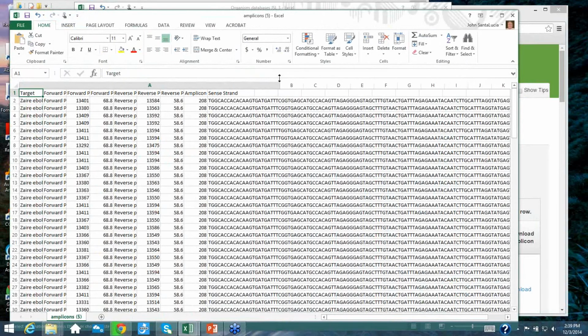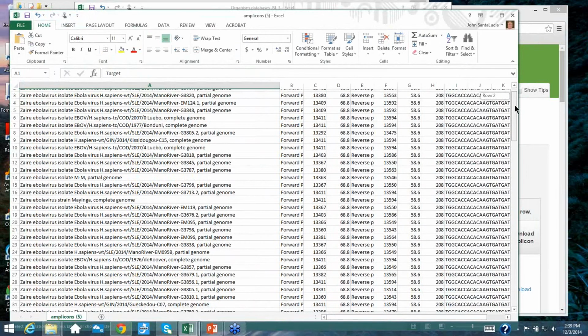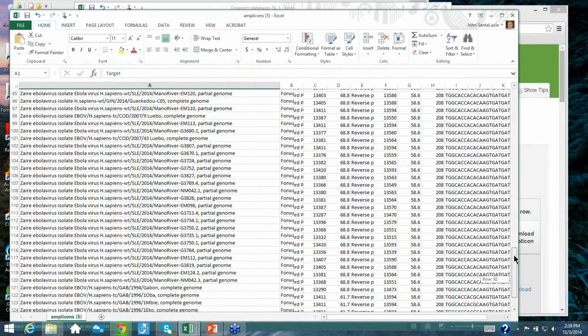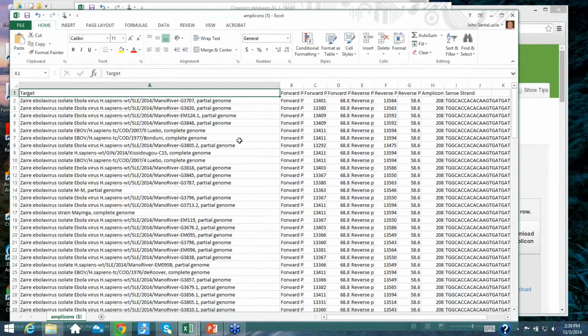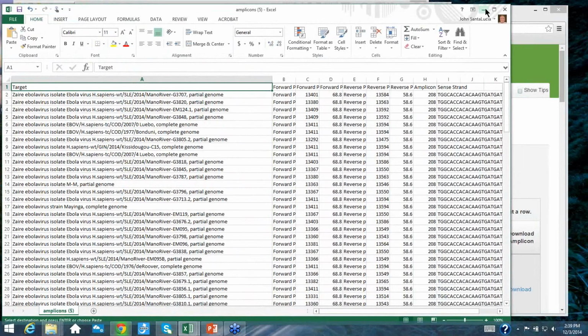These are different variants of Ebola here. And we can count how many are present. In this case, there's exactly 125 Ebola genomes that were hit out of 144. That's a pretty good set of primers to hit that high of a percentage. In fact, those last remaining 19 genomes probably have sequencing errors in them, because this set contains everything, including sequences from 1976, the original outbreak.